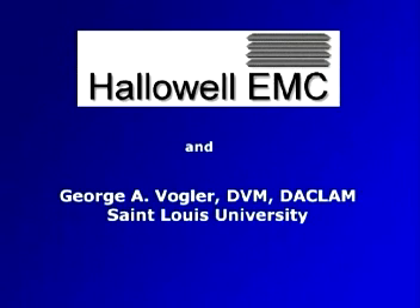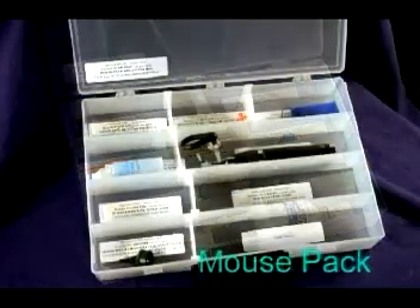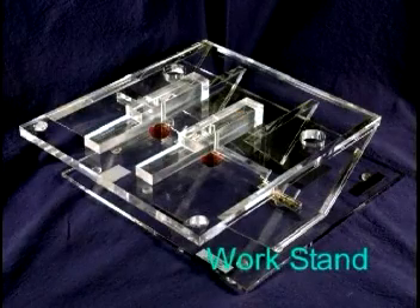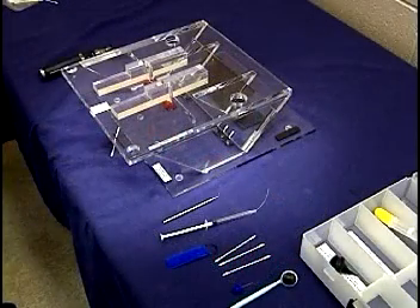Because the equipment needed varies somewhat between rats and mice, Hallowell has provided a separate rat pack and a mouse pack, which contain the appropriate equipment for each species. The rodent work stand allows you to securely hold the animal in a comfortable position as you perform the intubation. Intubation requires only a few seconds, so it is important to have everything ready before you start.